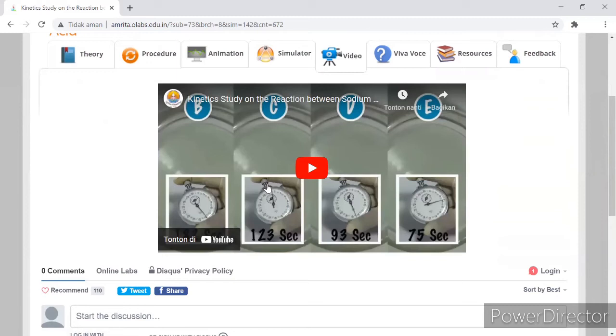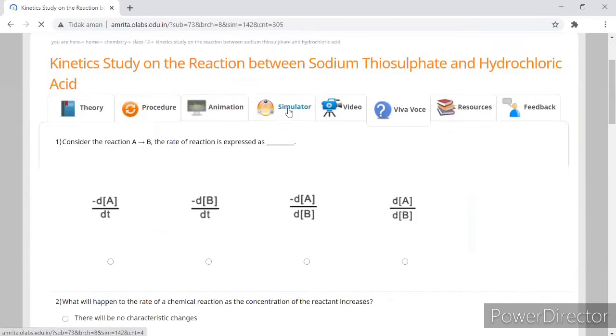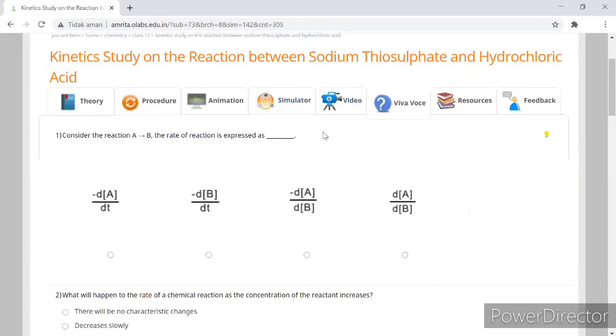and it will let us compare the experiment in the simulation and the experiment in the actual experiment. We can compare the time and also the form of the solution and other things in this video. Okay, so the experiment is already finished.